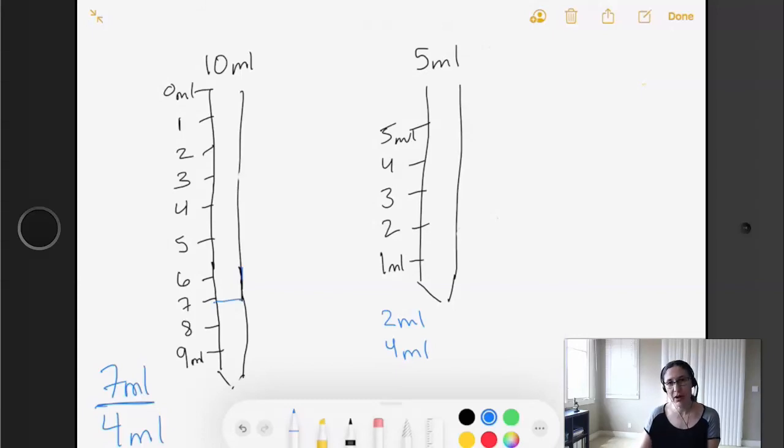Well, that would be wrong because as you release the volume, let's measure it. Here is 1 ml, 2 mLs, 3 mLs. You would only be delivering 3 mLs and not the 7 mLs that is desired. So if you want 7 mLs and you're using this type of method for measuring your volume on the pipette, you would actually aspirate your solution up to the 3 ml mark, you see?